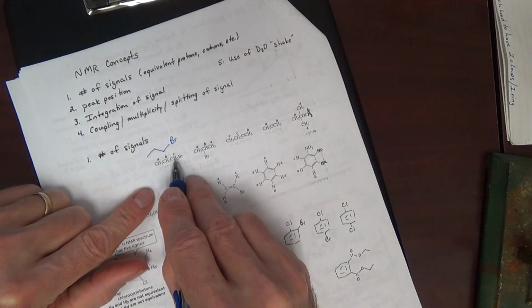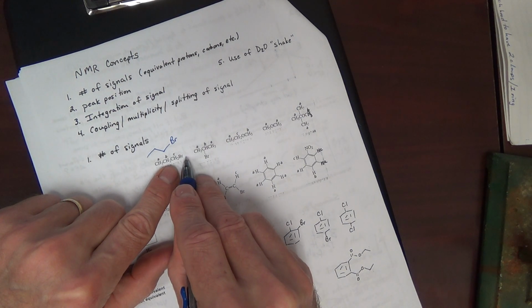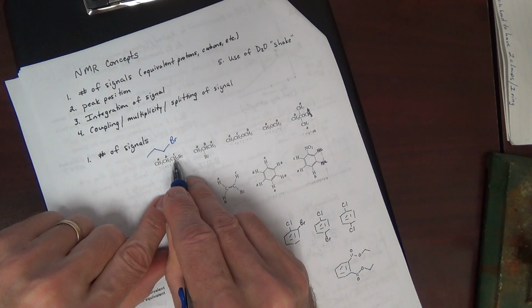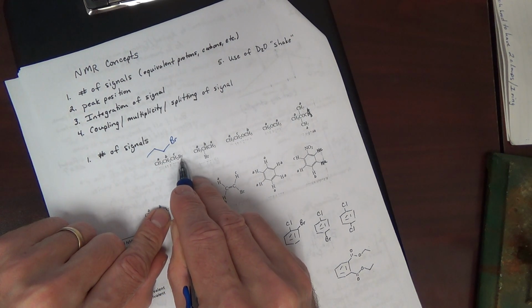Most downfield should be this signal for C. Why? Because the bromine is electron withdrawing, and it's going to serve to de-shield signal C, or these H's. And the de-shielding tails off as we move further away from the electron withdrawing bromine.